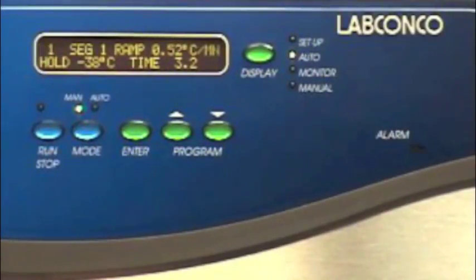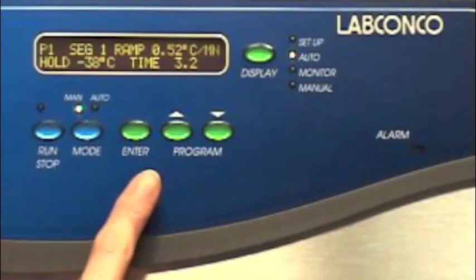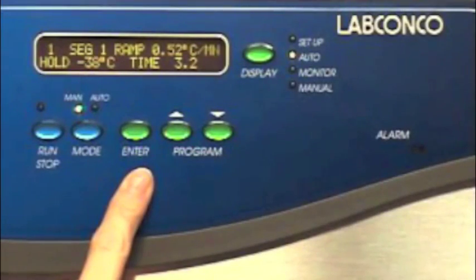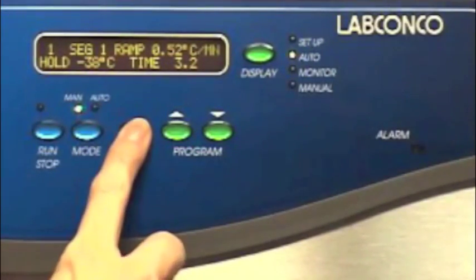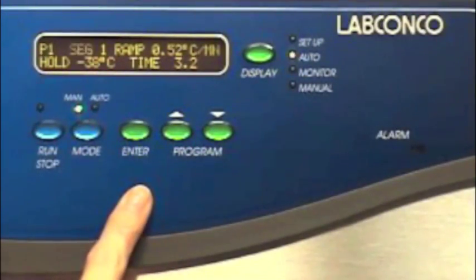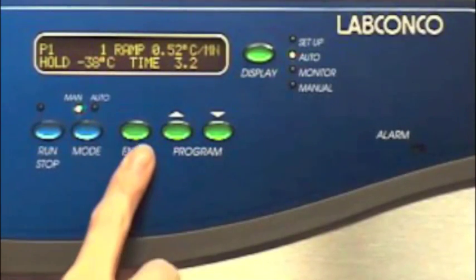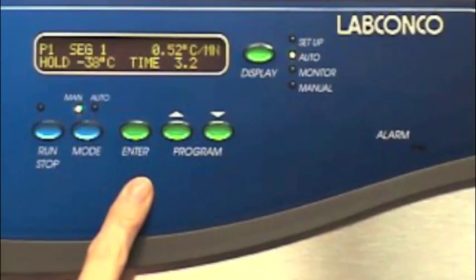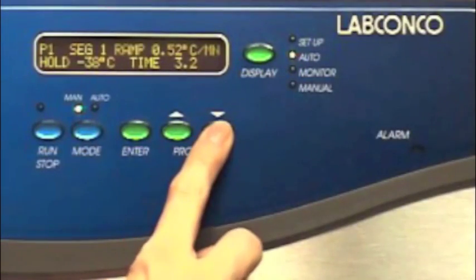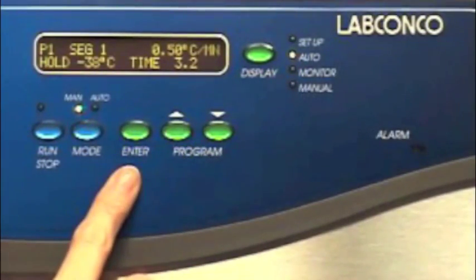Now we will program a sample lyophilization process. When we turn the power on, the LCD displays program number one. Press enter to display segment one parameters. Press enter again to advance the cursor to ramp. Now using the arrow keys, select 0.5 degrees centigrade per minute.